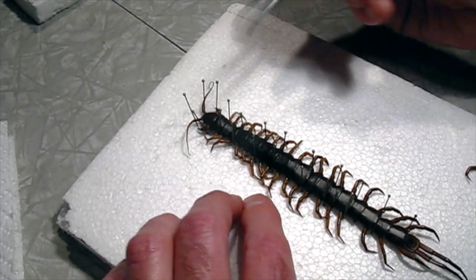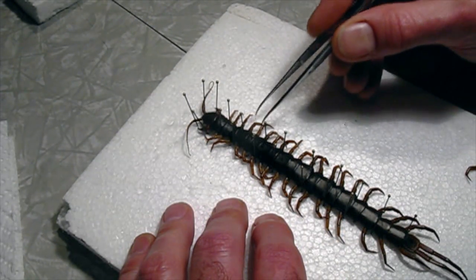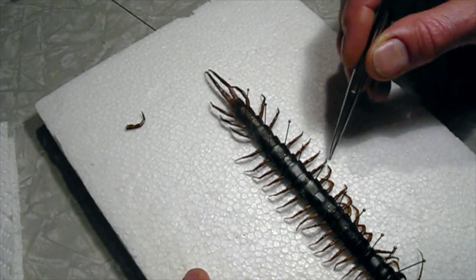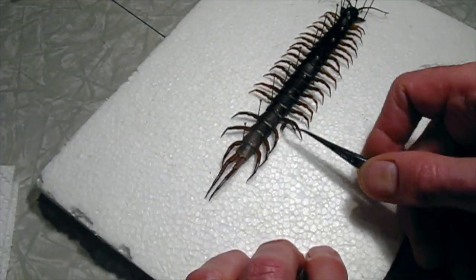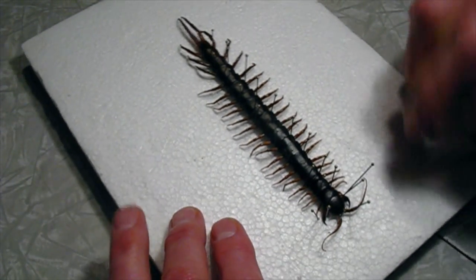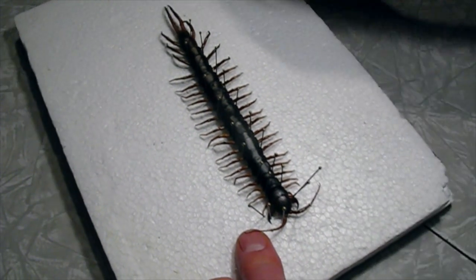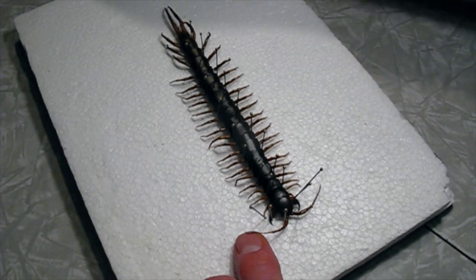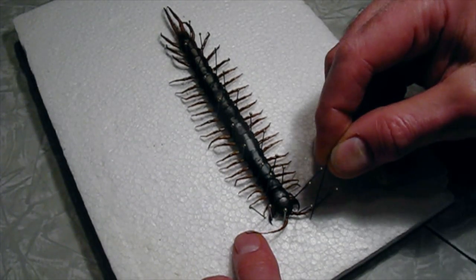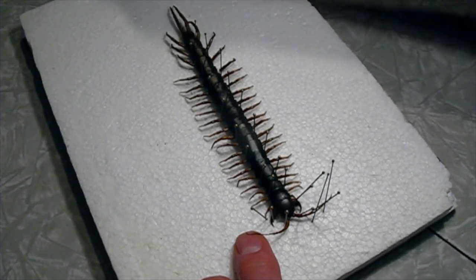Alright, that looks pretty good. Now I can just use my tweezers and kind of get the legs out in the general position I want them in. You can see the antennas are starting to curl up already as they're drying, so I think I'm going to address those right away. I'm going to use a series of pins to brace the antenna to try and keep them from curling up so much, in a more natural looking position.